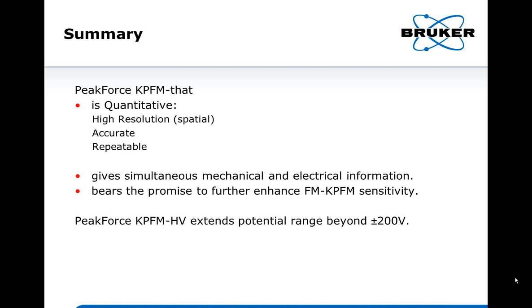Any comment on measuring work function on semiconductors, especially if you have very few carriers? And the question of whether you don't really get a Fermi level equalization on semiconductors in those cases?